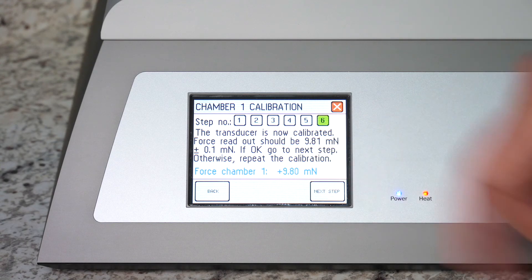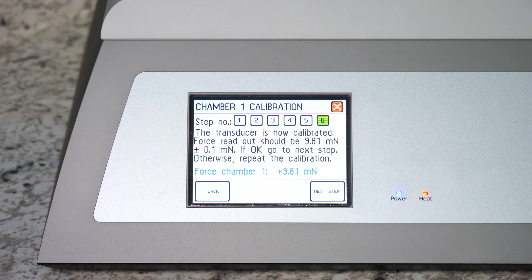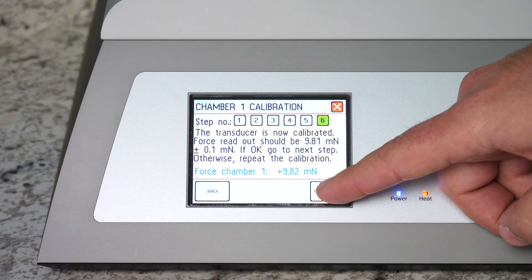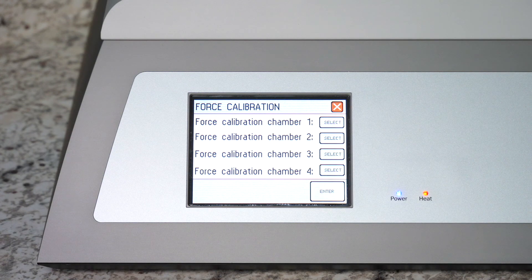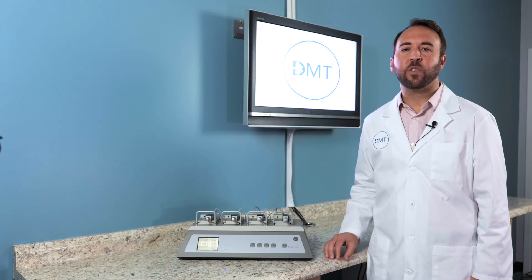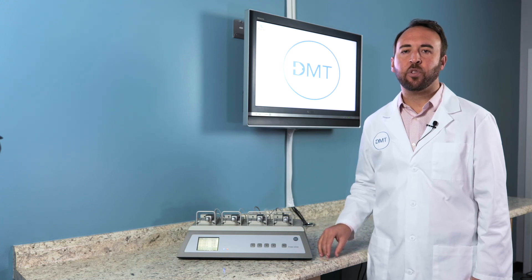The reading should be right around 9.81. If that's the case go ahead and hit next step to lock in the calibration. For more information please refer to the DMT 620M user manual or additional resource videos.